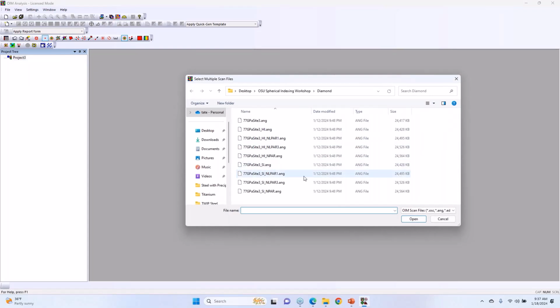So we have this. You can see that Will Lengthy, who implemented and did this, is great. He's smart and helpful and wonderfully nice. He went and re-indexed at different levels of NLPar and NPar too, to look at the effect and see what we could get.